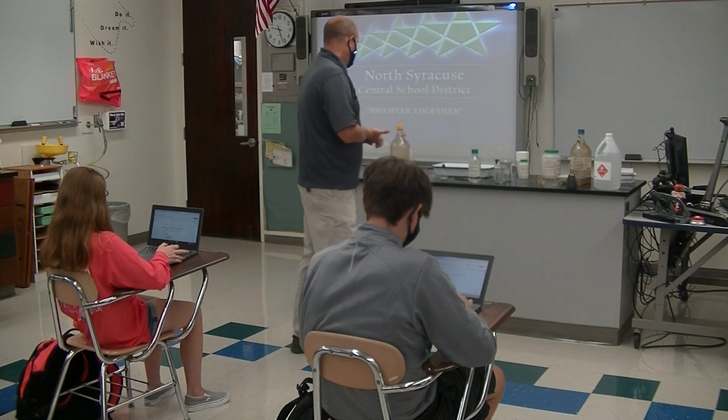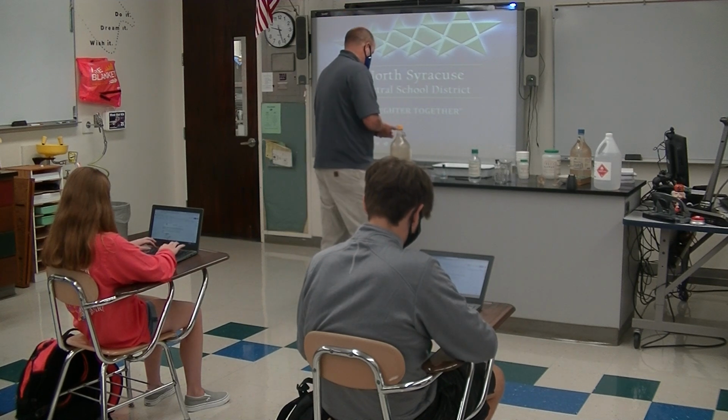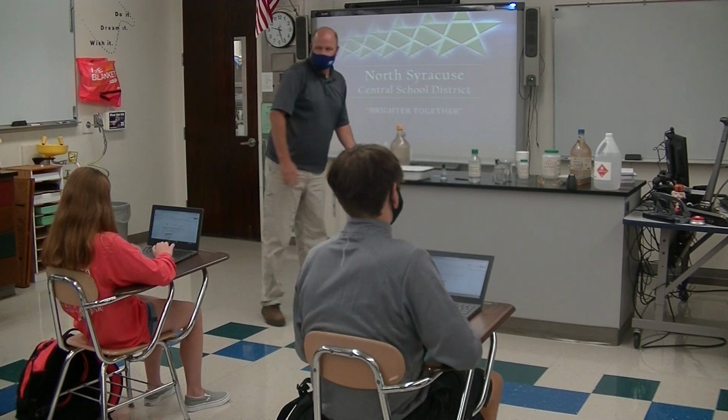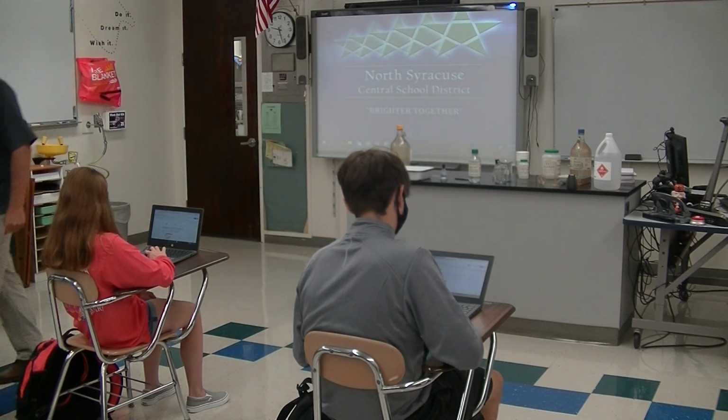Okay, you can type it. All right, detection for an acid is a warm burning sensation. All right, I'm going to show you what an acid can do. This is pretty strong acid.